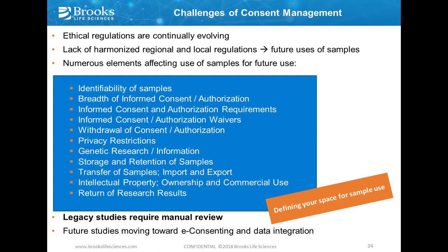Having this all said, I highlighted legacy studies here, because legacy studies require most of the time manual review, and they are the studies that really hurt us, because there we have to do lots of footwork to really have the right picture of what we are allowed to do with the sample. So hopefully e-consenting and better data integration will help here in the future. Taking all this together, basically these are the factors that define the space of our sample usage.